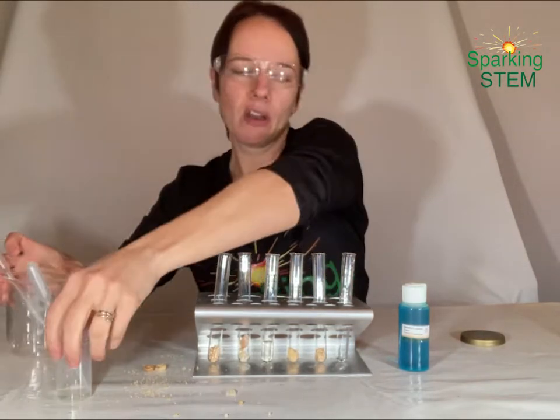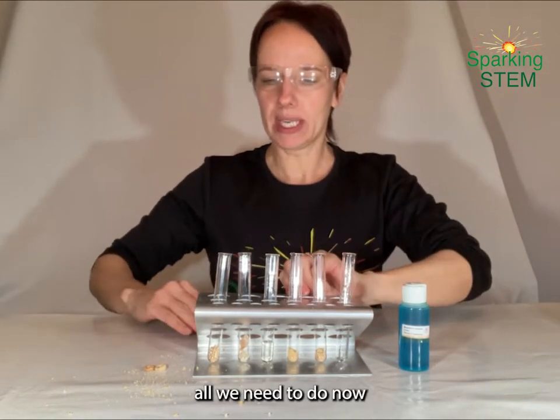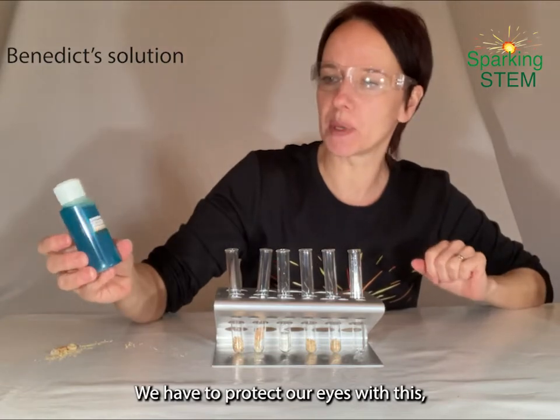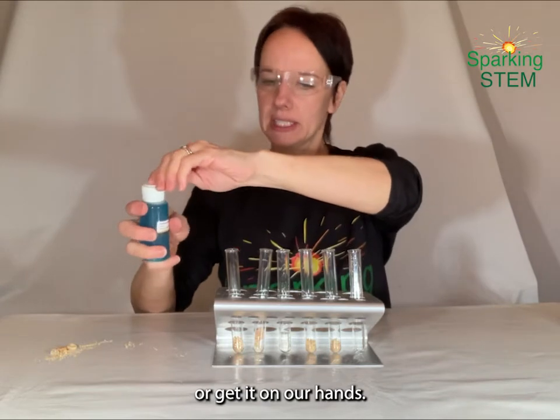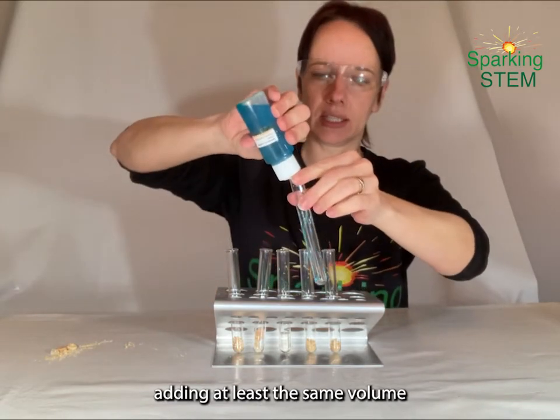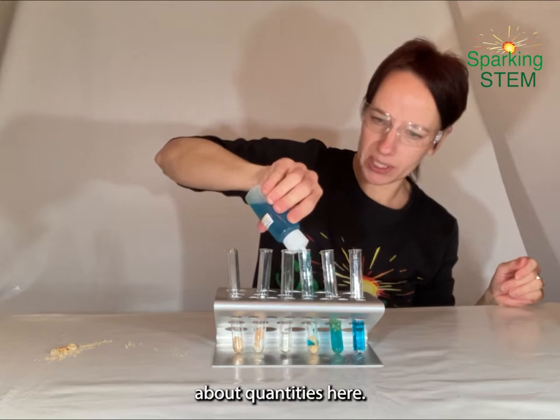Excuse the mess. Once we've got our things we want to test here — our specimens, our samples to test — all we need to do now is add our Benedict's solution. Here's our Benedict's solution. We have to protect our eyes with this and it's an irritant — we don't want to swallow it or get it on our hands. So I will add it from this dropper bottle and I'm going to add at least the same volume as I've got of the substance, although I'm not being too careful about quantities here.